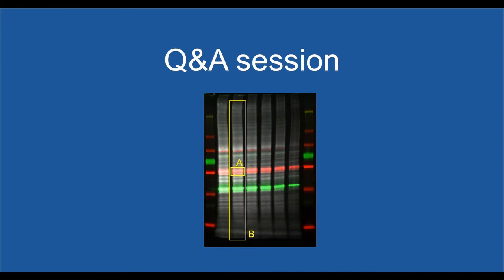If you look at the Morris paper, the publication that I mentioned just now, the authors did mention the limitation of Ponceau S, the limitation of detection. So you might need to check it out. I think the easiest way to check this is to test it with a fresh blot. Let's say you're running a blot right now and you have an unused lane. Then you load the lane with your positive sample, for example, something you know is working.